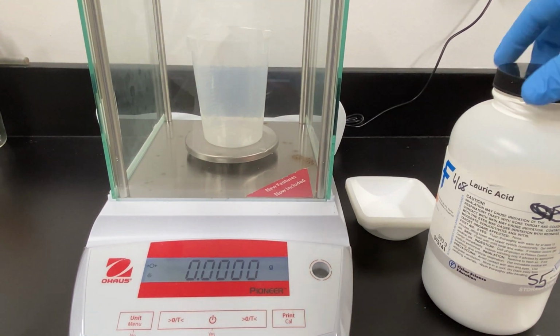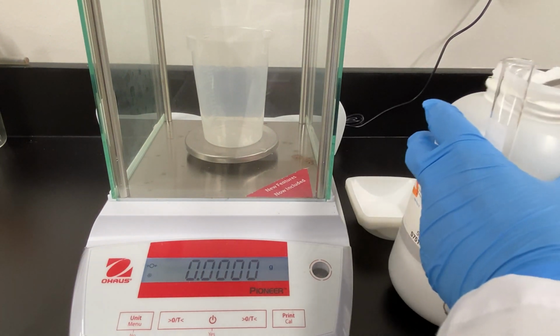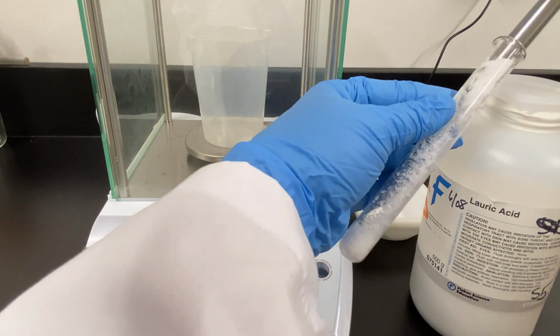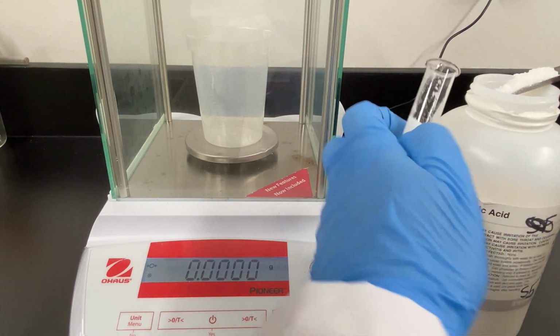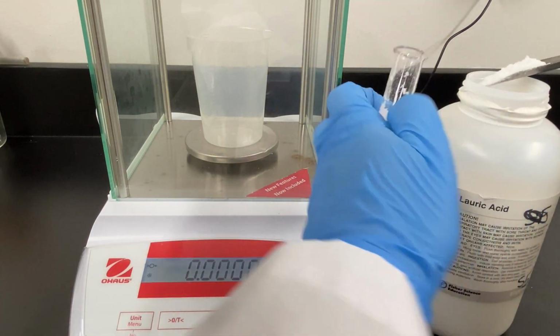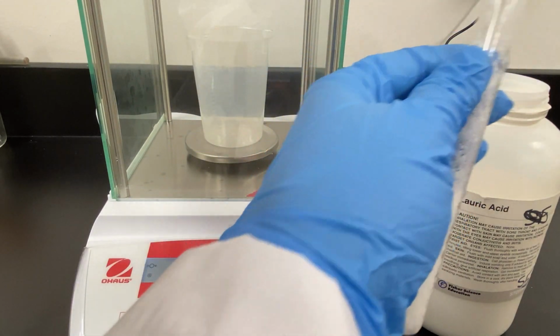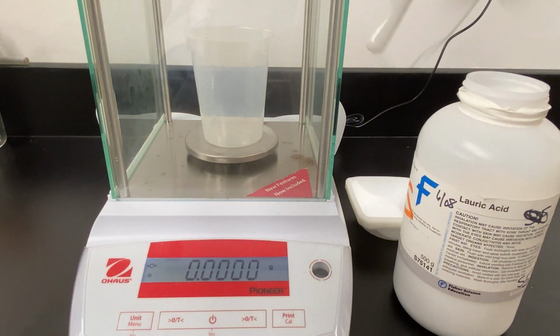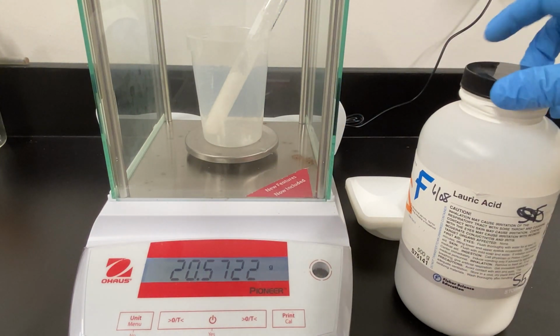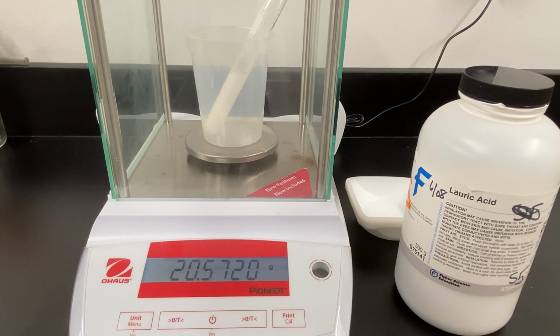Add enough lauric acid to fill the test tube approximately halfway. Measure the mass of the test tube and lauric acid, then subtract the mass of the test tube to determine how much lauric acid was added.